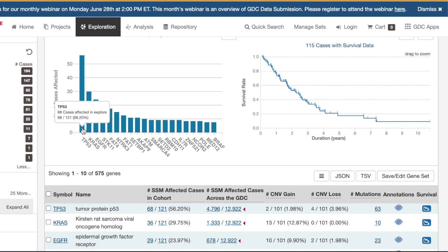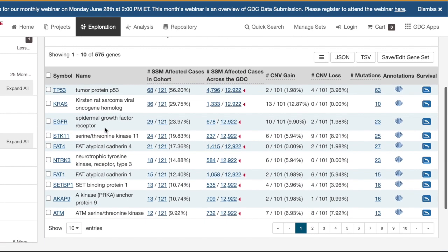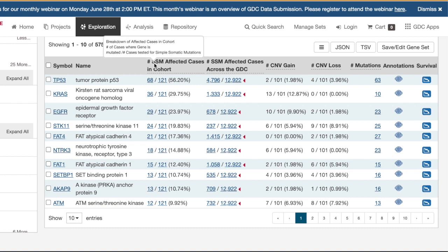Who here has heard of STK11? Before this I really hadn't heard much about it, which made me think — let's investigate this criminal. It's the fourth most mutated gene in this subgroup, so it's got to be pretty important. Going down, we can see this gene — Serine Threonine Kinase 11. These are small single mutations, and in our 121 samples, 24 of them have a mutation in STK11.